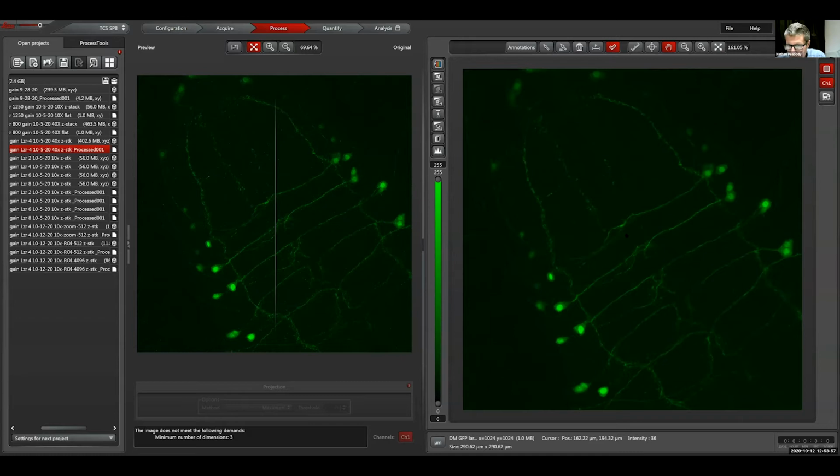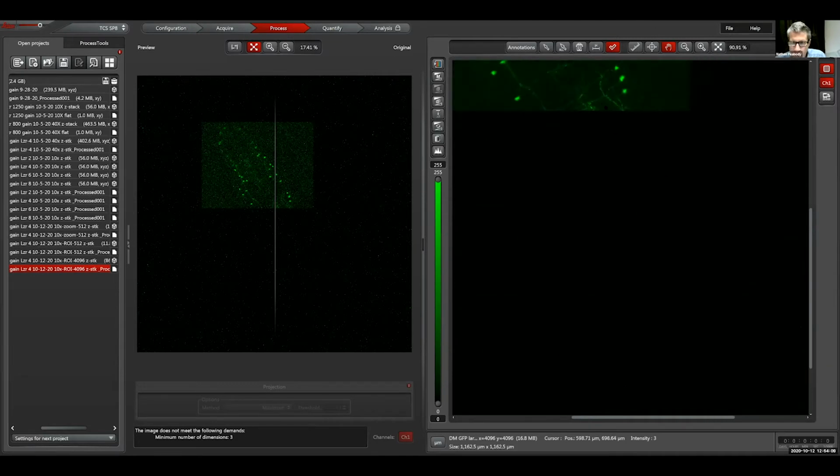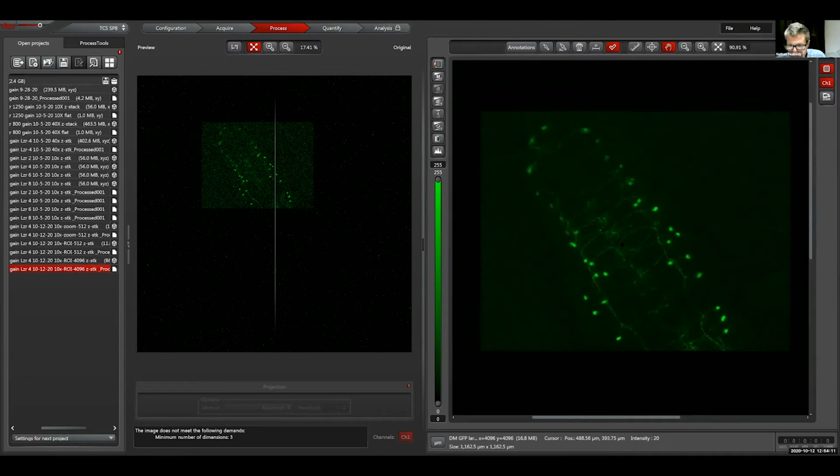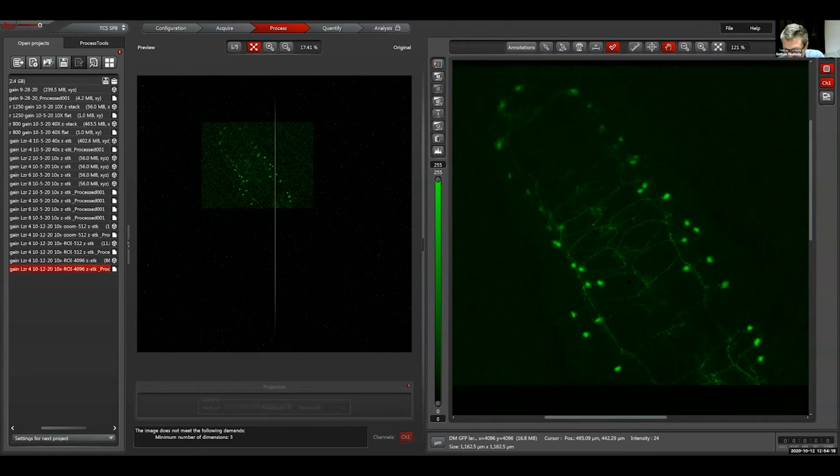is much, it looks like real GFP with not a lot of background noise. Whereas when we go here, you can still see some stuff, but it's pretty fuzzy. But you can see the beginning of the nucleus versus the rest of the cell. I see. All right, so there's information in there.